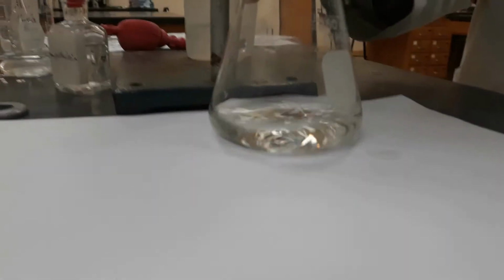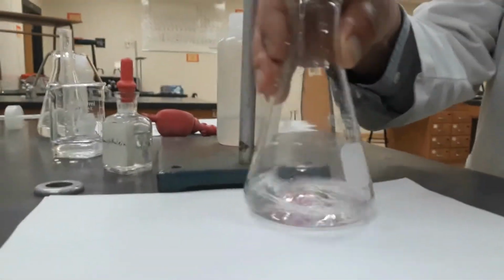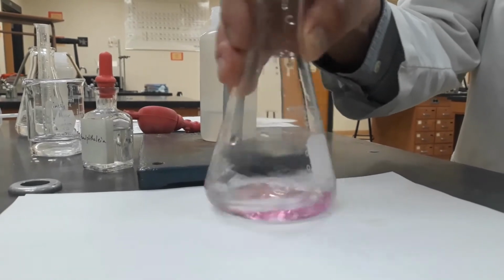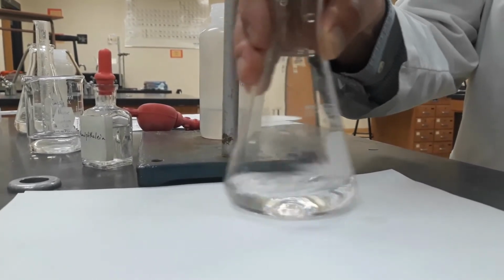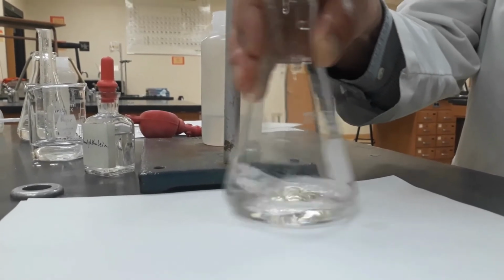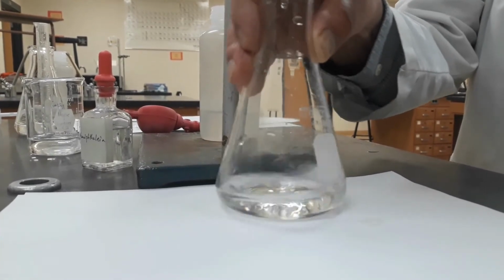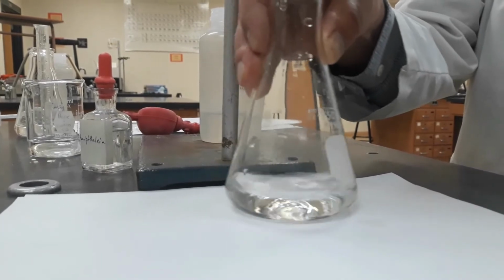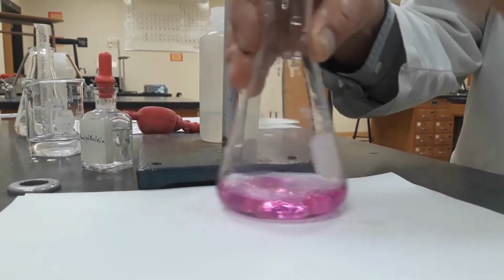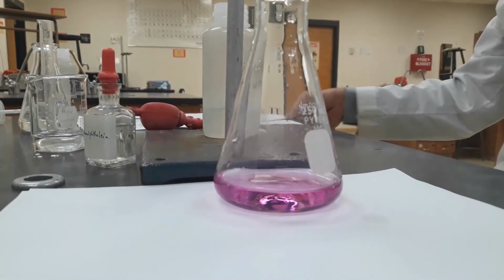Ooh, taking a little while for the pink to go away. One drop too many. Okay, so there's our first reading.